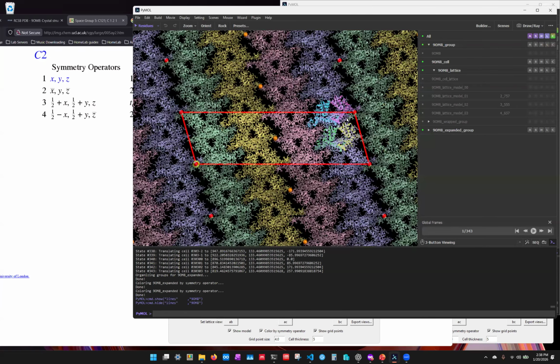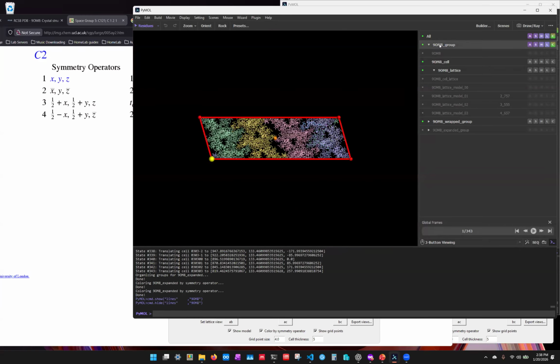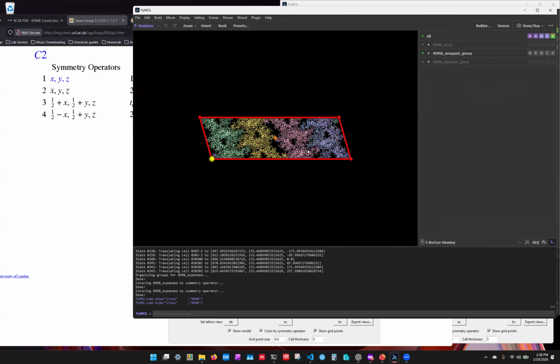Right, so now that we have this, we now know the position of every single atom in the entire crystal, in theory. I mean, crystals aren't that perfect, but let's say you were some crazy mad scientist that found some way to make a perfect crystal.